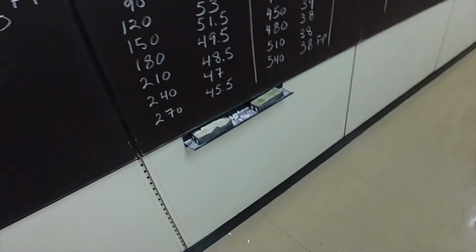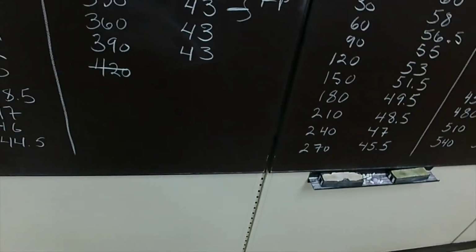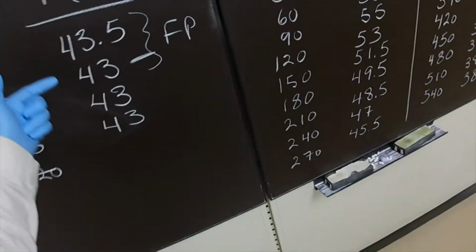But now, what do you do with this data if, let's say, you forgot to observe the temperature at which it froze? Well, of course, you can see from here that when it stops changing, that's the freezing point.